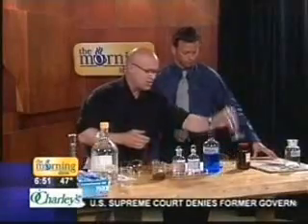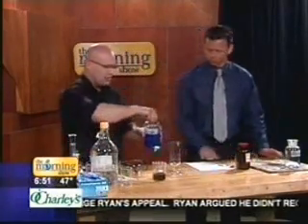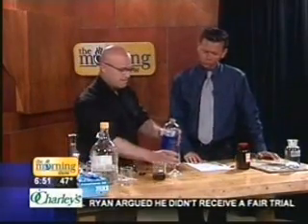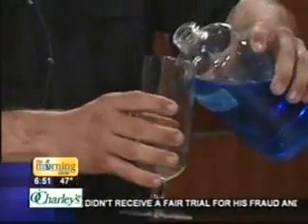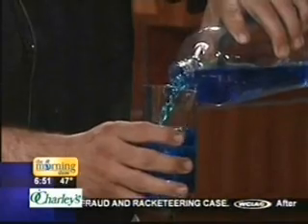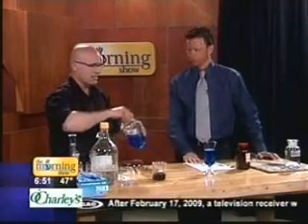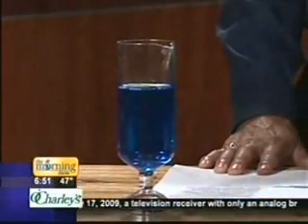All right, cool. Now, what sulfuric acid is used for a lot in the mining industry is selectively precipitating out different metals. What I have here is copper sulfate, and in the copper mining industry, they use sulfuric acid to dissolve a lot of the copper salts, because it doesn't just come as chunks of copper.